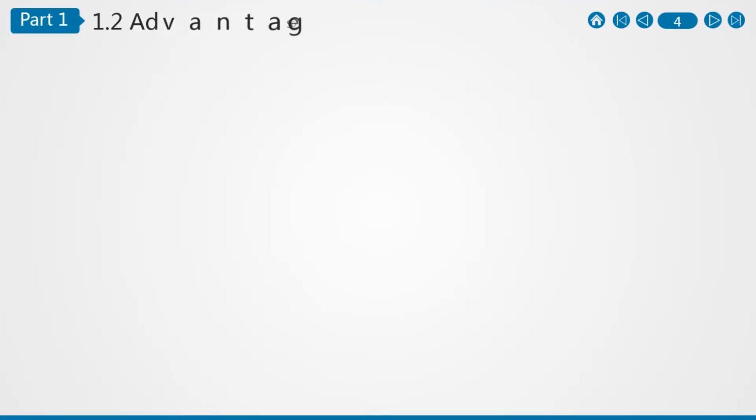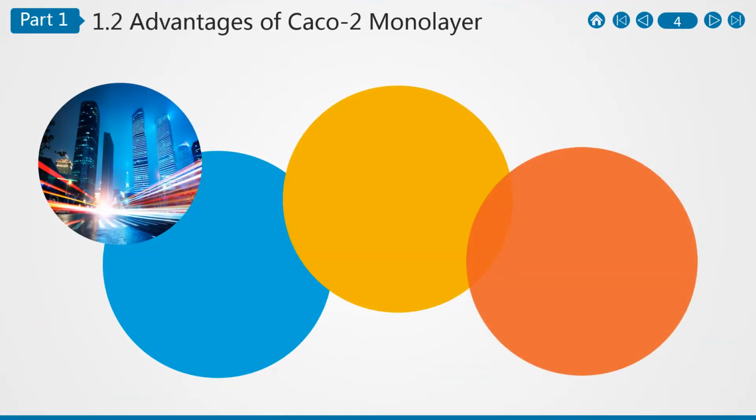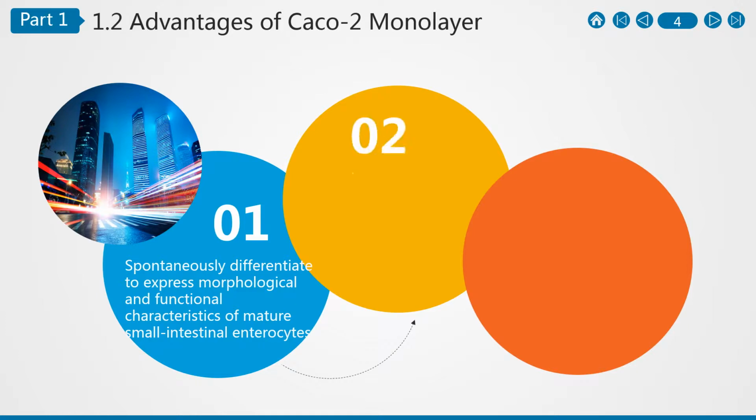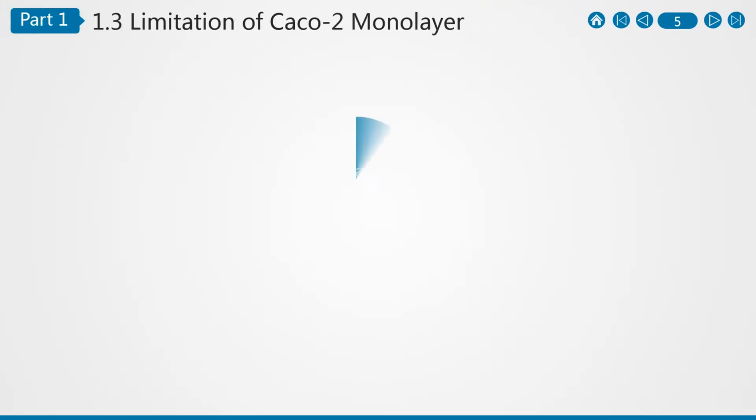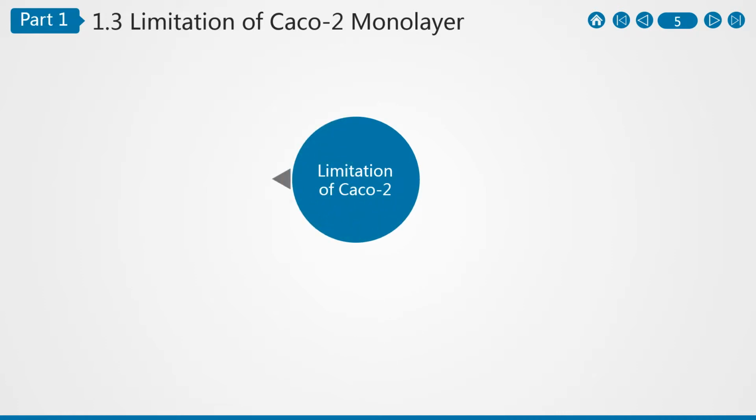When cultured as a monolayer, Caco-2 cells differentiate to form tight junctions between cells to serve as a model of the paracellular movement of compounds across the monolayer. In addition, Caco-2 cells express transporter proteins, efflux proteins, and phase II conjugation enzymes to model a variety of transcellular pathways as well as the metabolic transformation of test substances. In many respects, the Caco-2 cell monolayer mimics the human intestinal epithelium.